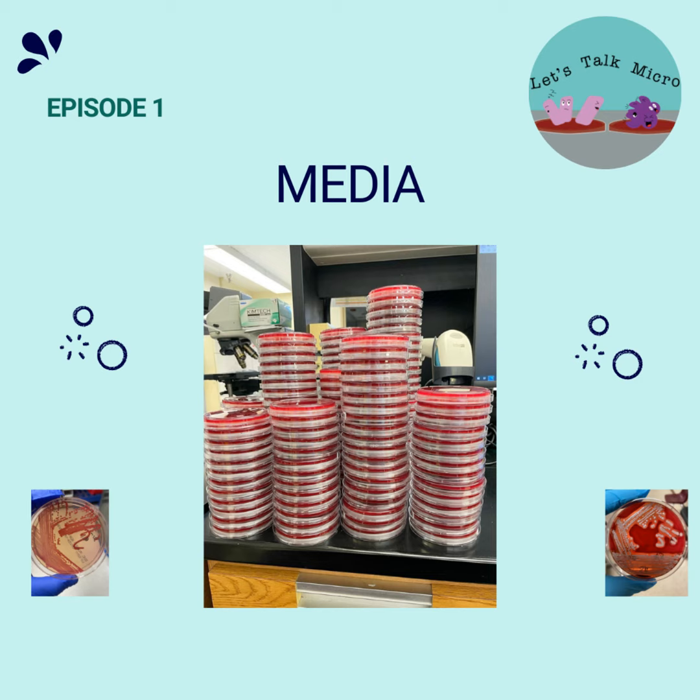And the goal of this is that at the end, you have some nice isolated colonies. And why do we need that? I mean, you have to keep in mind that our body's full of bacteria. You can have infections with multiple organisms. So if you don't achieve isolation, it's hard to get that organism by itself, so you can do a proper ID. You can run susceptibilities on it. Also, you might miss an organism.